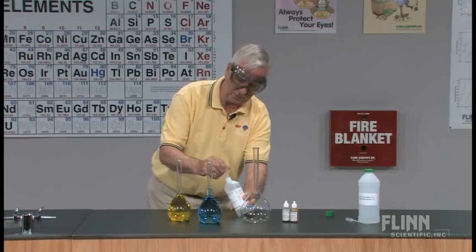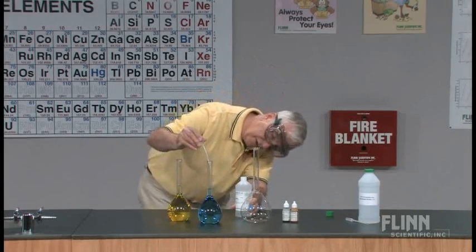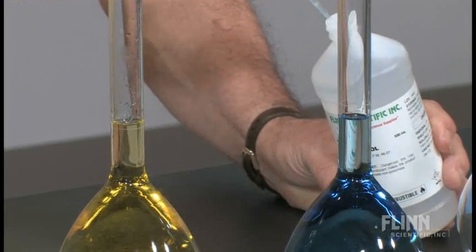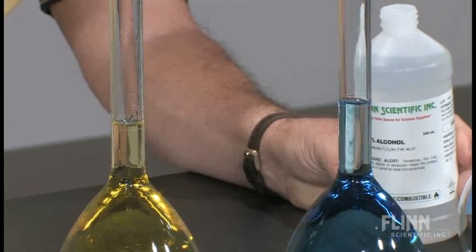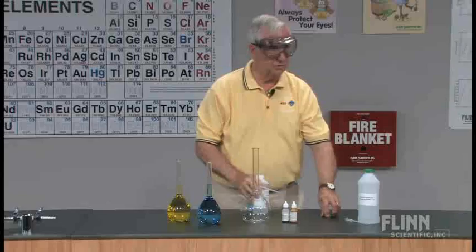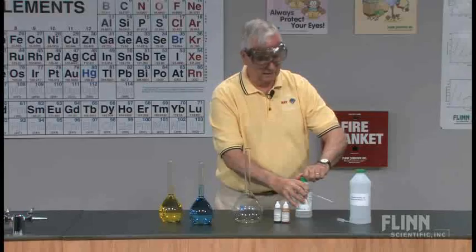Now it's important to know that if you do this and use food coloring as I have here, remember that the yellow dye must go into the water. If you put it into the alcohol, it will gel up into the bottom and will not go into solution. The yellow dye is water soluble but not alcohol soluble.